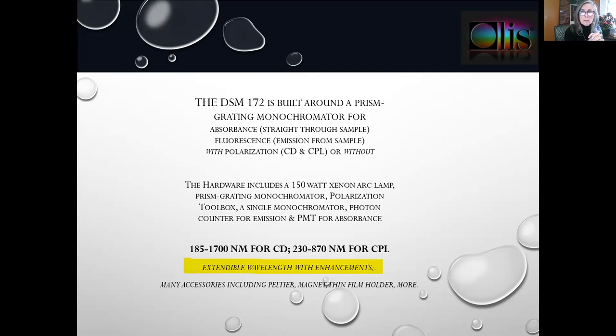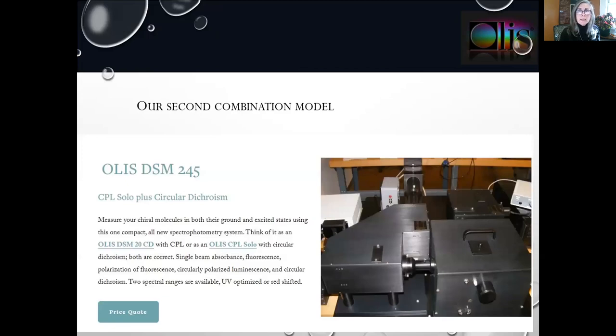For CPL, your detector will be the photon counter; for absorbance and CD, a photomultiplier tube. The default range for this instrument is 185 to 1700 nanometers, extendable to 2500 at additional cost. The standard configuration is ultraviolet visible for CPL. Many accessories are available for polarization, magnetic field, thin film holder, and so forth, and this holds true for the solos as well — any accessories compatible with any one of these four instruments is interchangeable with the others. The second combination CD-CPL instrument is the 245.